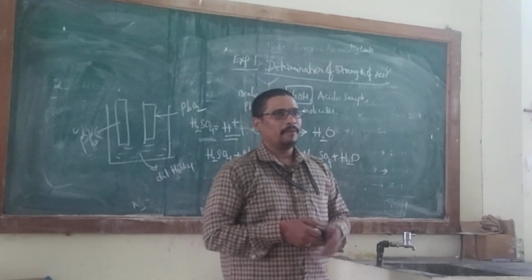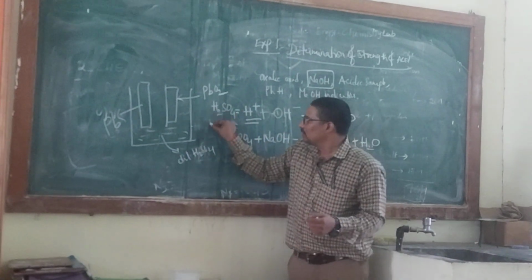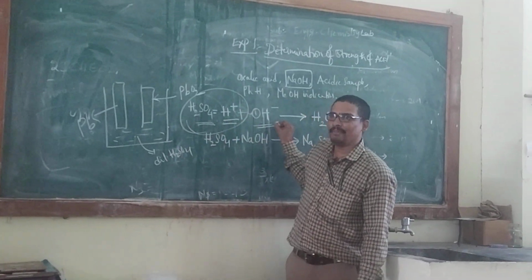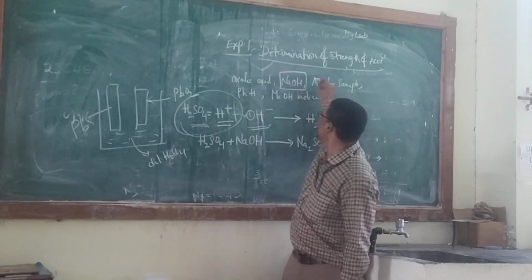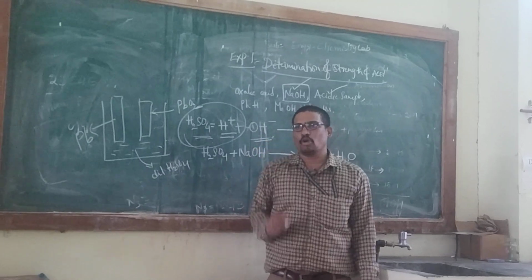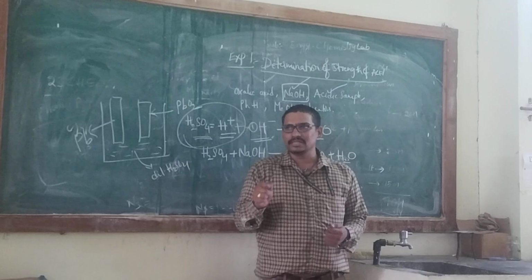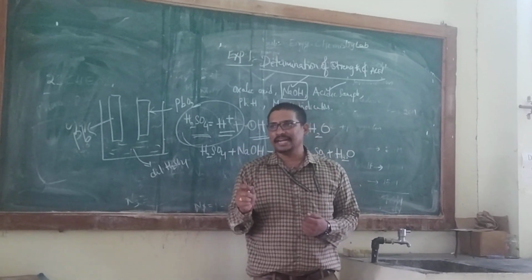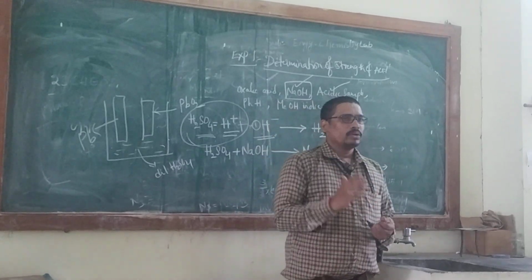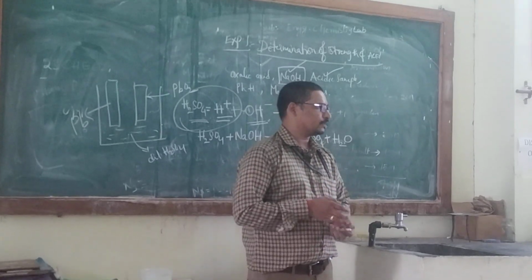Under the principle, we come to know that the acid sample is titrated with sodium hydroxide by using an indicator called methyl orange indicator, and the end point of the titration is yellow color. So this is the titration process. Now let us go for the next important aspect.